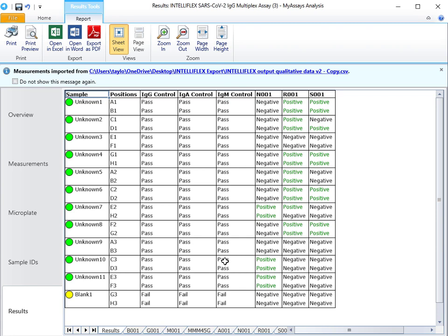This means that the service will start automatically each time the computer is turned on, so no further configuration is required, with the data files exported to the specified folder being processed by MyAssays Desktop automatically.